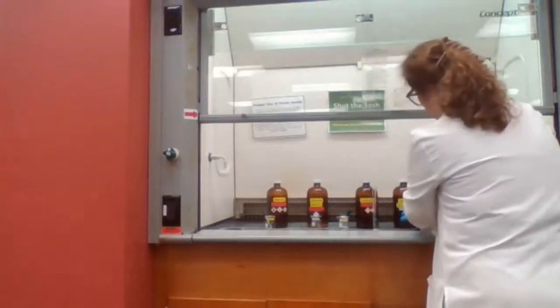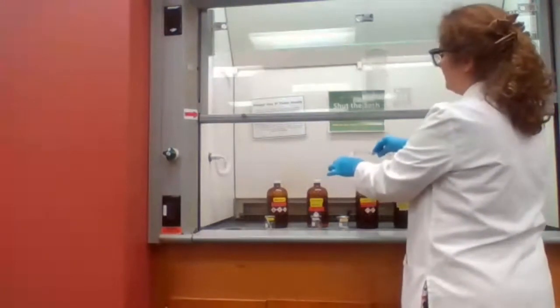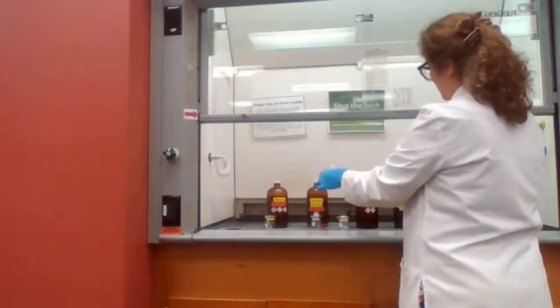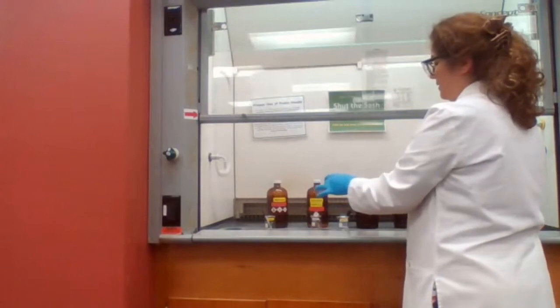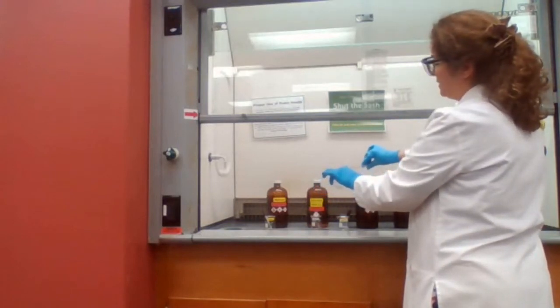Sulfuric acid, and I'm going to add slowly, maybe a few drops at a time, mix it well, and let it cool off before I add the next portion of the sulfuric acid.